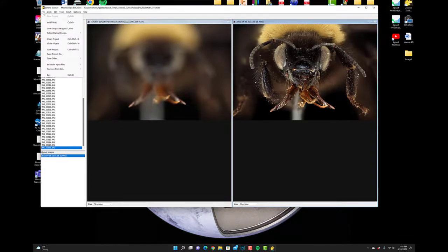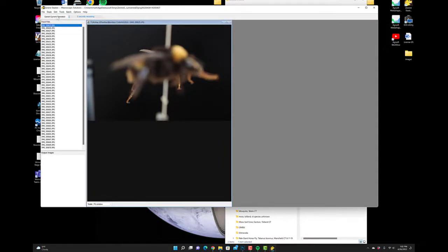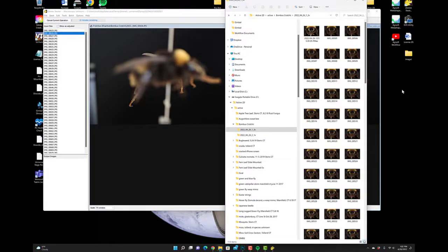Okay, so then to process the next image, we're going to do File, Close Project. Name this one 2 dash 1x, that was our magnification. Drag, and again, we're going to stack from the back to the front. Okay, so while that's processing, now what we can do is move directly to editing our 3x final image.